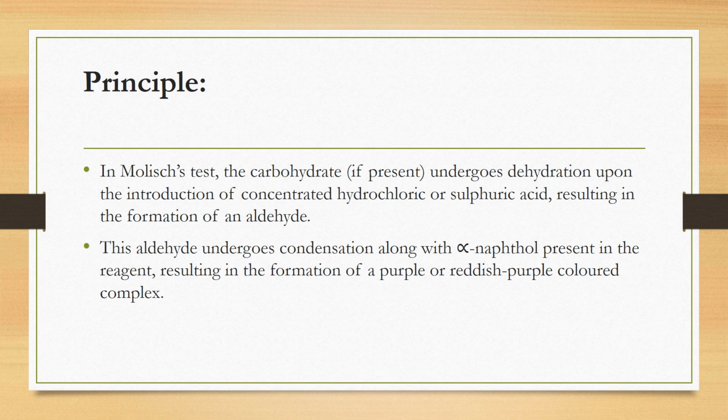This aldehyde undergoes condensation along with alpha naphthol present in the reagent, resulting in the formation of a purple or reddish purple colored complex.